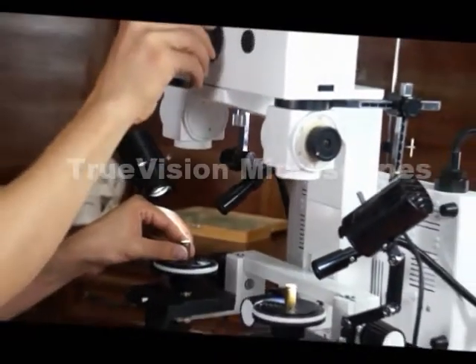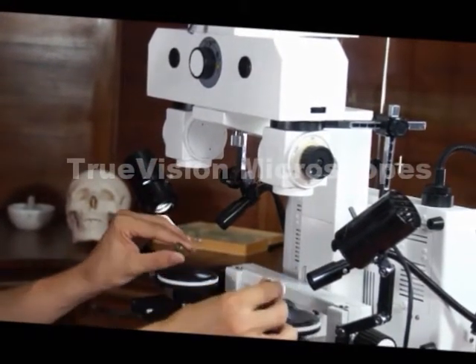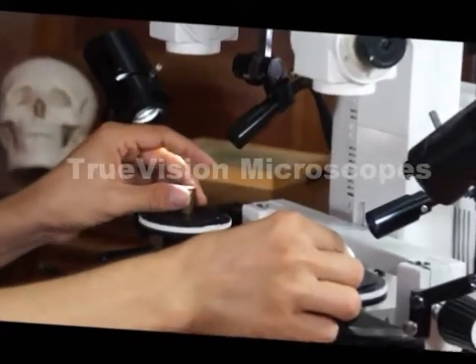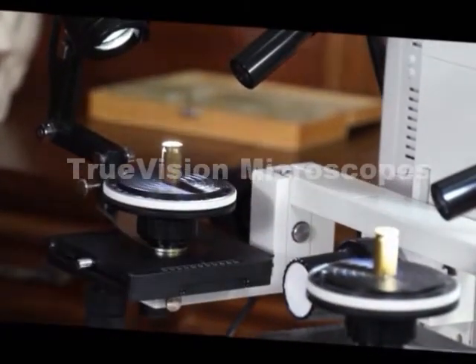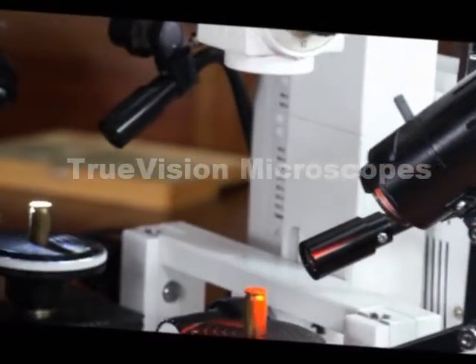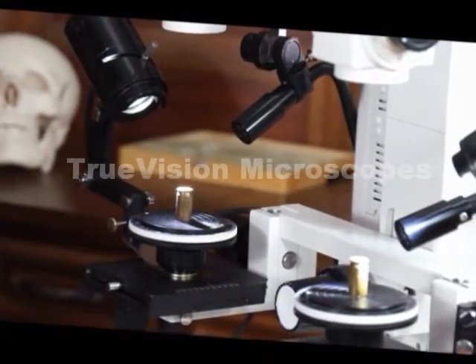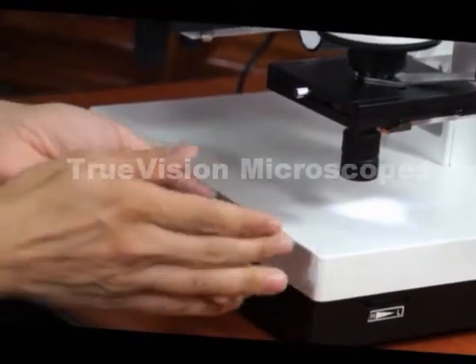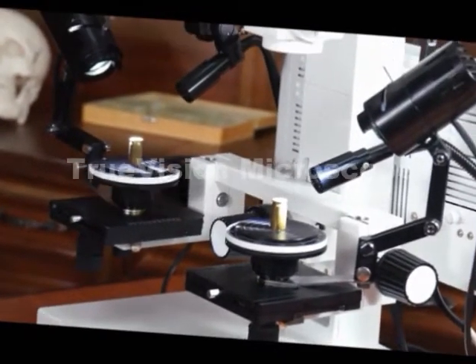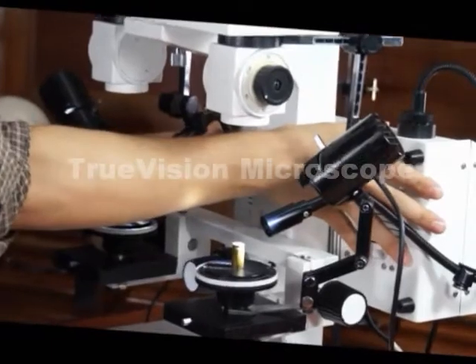If you turn the knob a certain direction — for instance, to the left a little more — you might only show one quarter of one and three quarters of the other. Or you could turn it to the overlapping position, where you see both images. When you do the overlapping, you might want to put a color filter on one side. These come with red and green filters that can slide into place. This microscope is good because we've got color filters and a very high-intensity illumination system in the back.